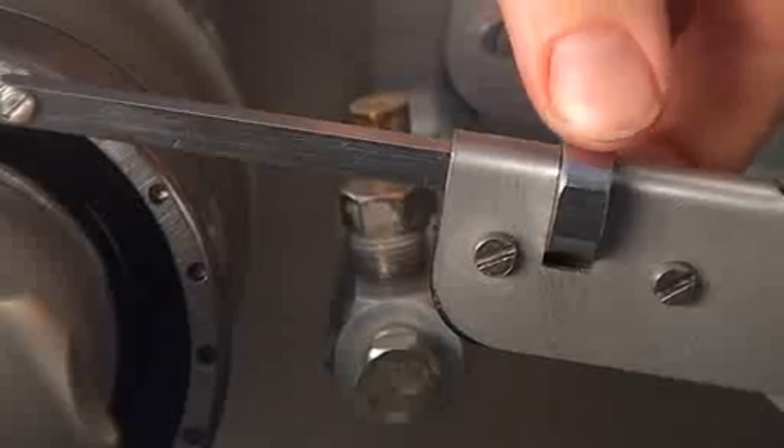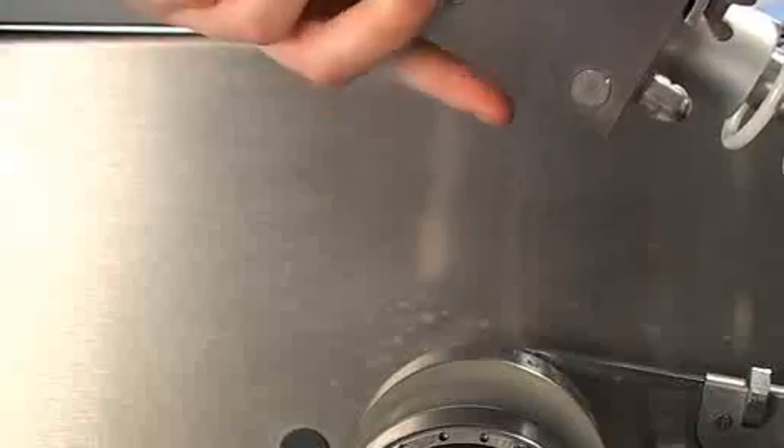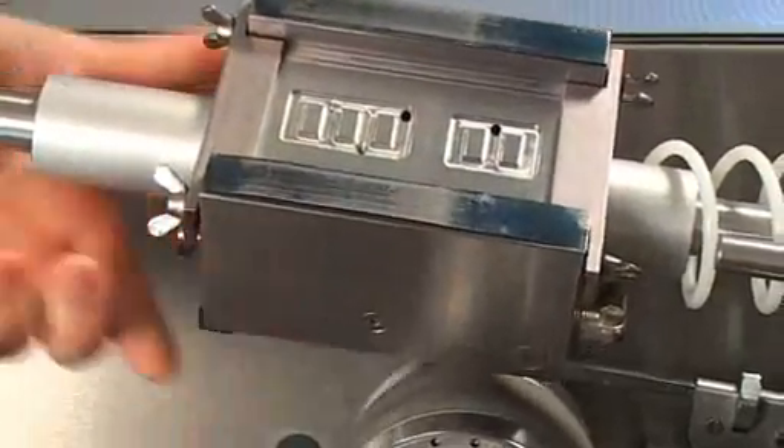Even finer adjustments are available, which allow you to control the final thickness within microns, assuring you an outstanding accuracy of the grinding thickness. The other part of the grinding section is the vacuum holder, which holds and moves the sample over the rollers for grinding.